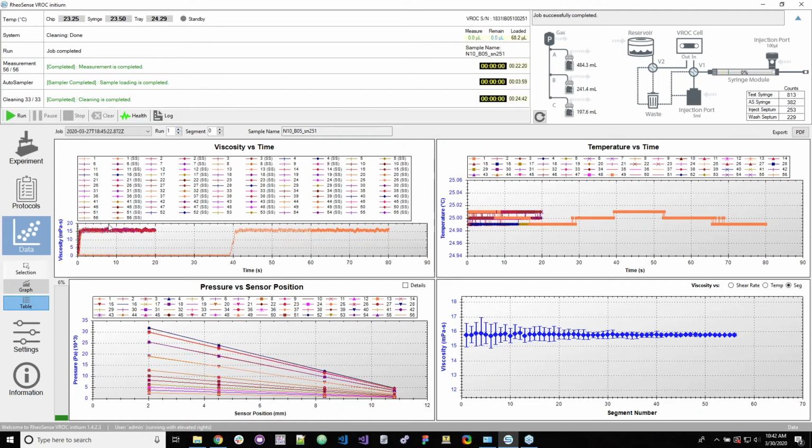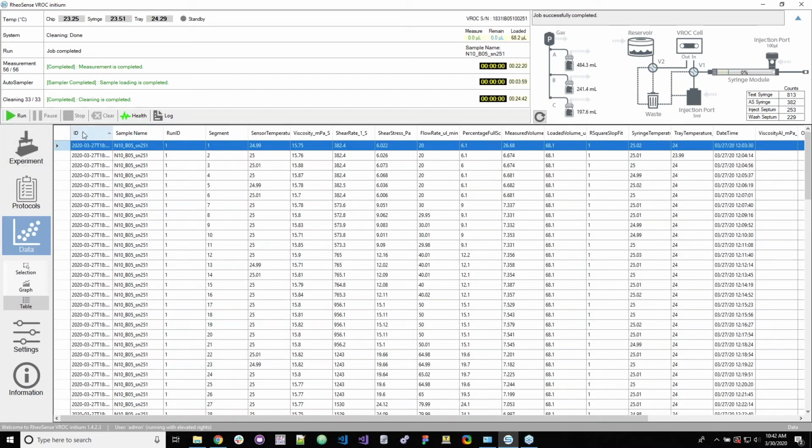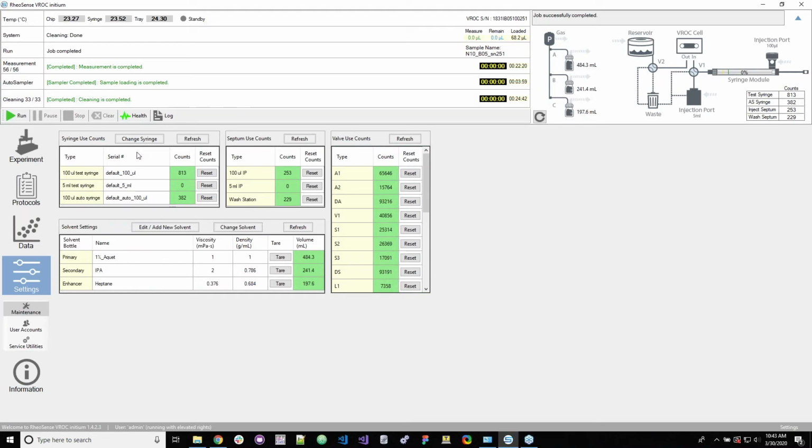tab. And then we have the table tab here, which is similar to the table tab in the experiment tab, and it's going to show you the run ID number, the sample name, that specific run or vial, the measurement segment, measurement number, the temperature of the sensor, all the information that you want to keep track of. And if you want to sort things, you can double click. It'll sort based on flow rate or shear stress or shear rate, whatever you want to investigate, you can cycle through here.